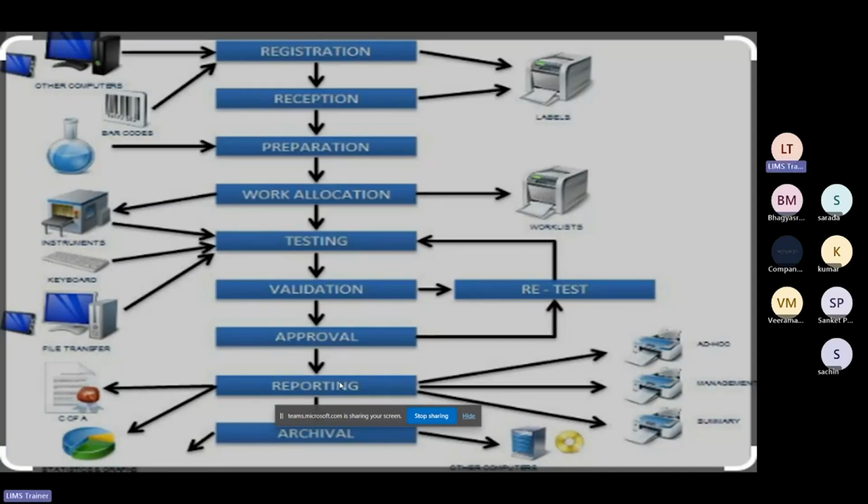Yes, please. Archival is required because whenever we complete our report, we have to store everything somewhere so that we can access it whenever required, like in an audit or anything. Otherwise it will be stored somewhere and that memory will be filled. Yes, that's why it is important.